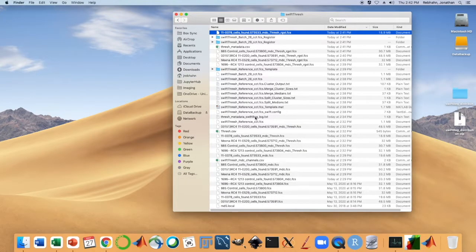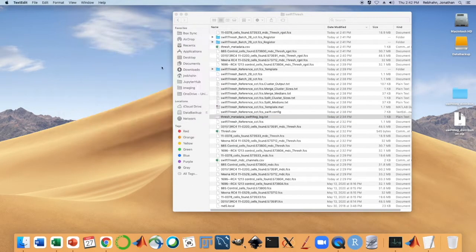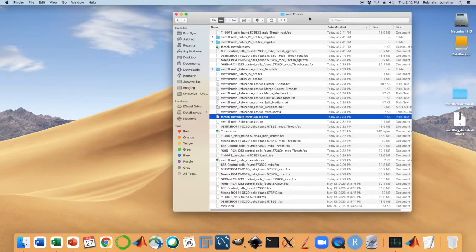As always, there should be a log file that describes the process as well. And that is registration with CyTOF data, in which there were a few extra error checking steps in the beginning during the validation, as well as the application of the threshold transform to the CyTOF data.